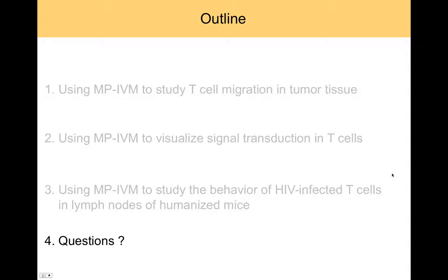Okay. For people that may not have had an opportunity yet to use multiphoton intravital microscopy to study immunological problems, what would be your advice to somebody that thinks that they have some interesting questions they might want to start using this technique to get engaged in their research?